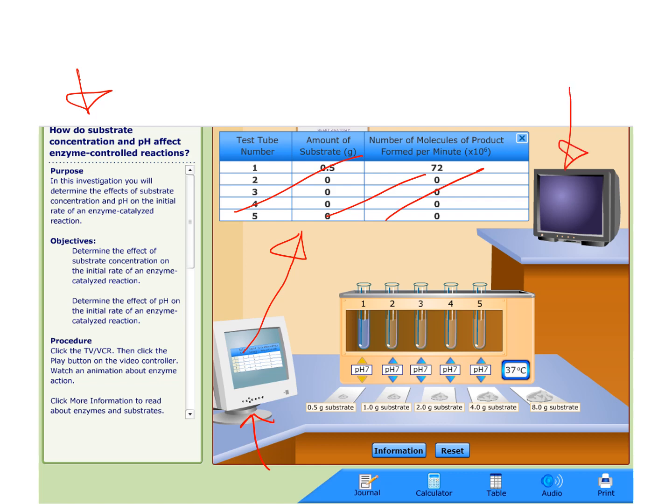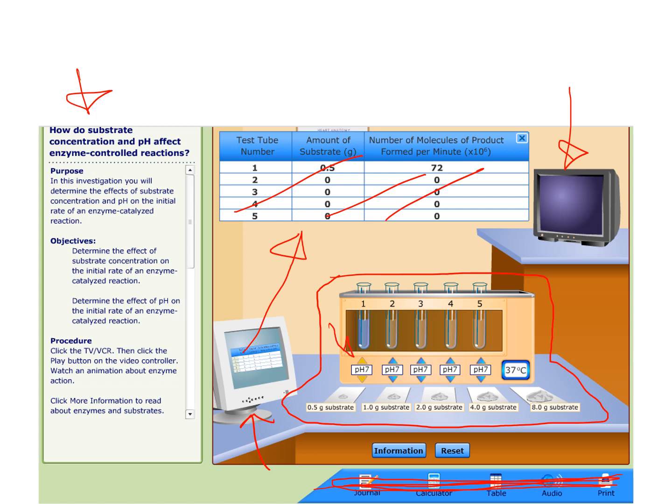And I'm going to be nice and just tell you this stuff down here, you can just completely ignore it. I was fishing around with it. Some of them appear to be broken, actually. This is kind of an old link, I think. All right, this is what you are mostly going to be interested in here. So like some of our past labs, you can kind of push some buttons here. So right here, that's a pH button, and you can push the top one right here and it'll raise the pH. You can push the bottom one right here, it'll lower the pH. Same thing for this one, up, down. Right, great, that's pretty cool, pretty simple.